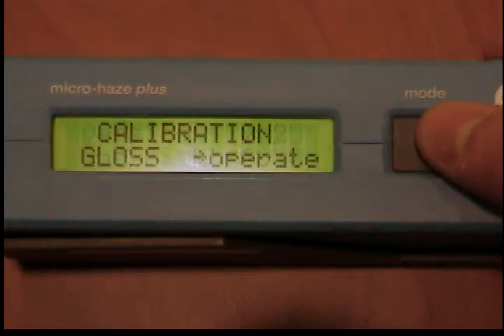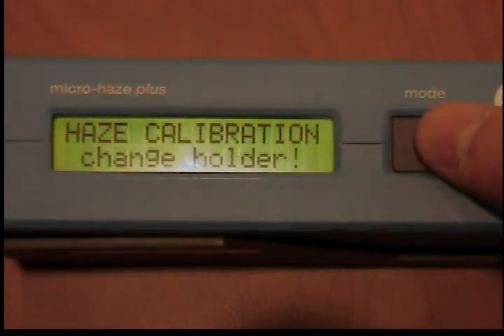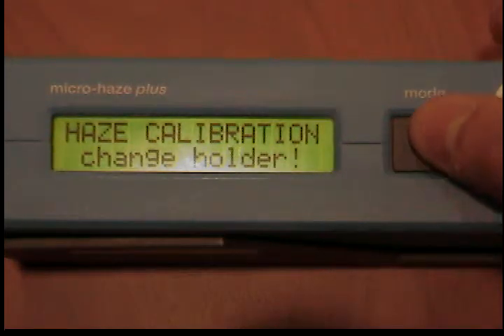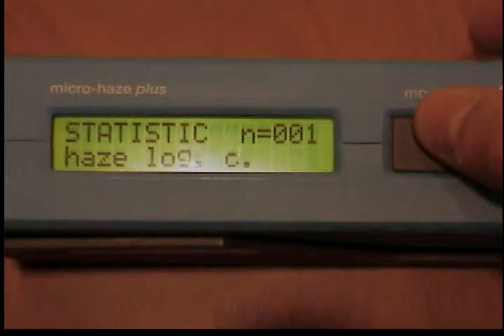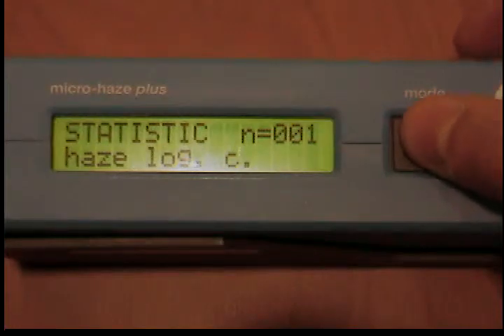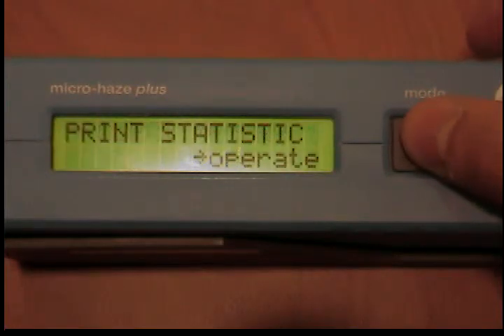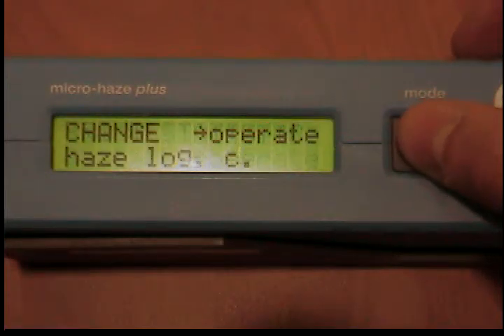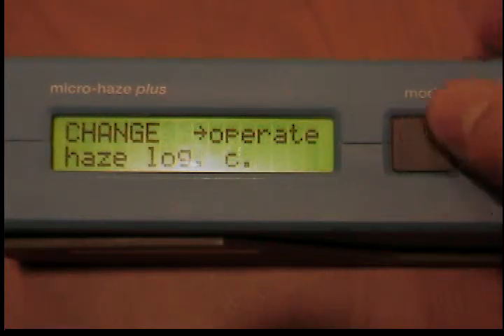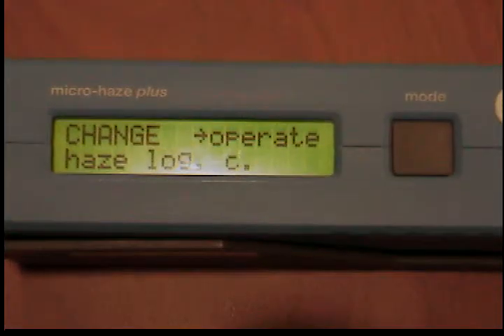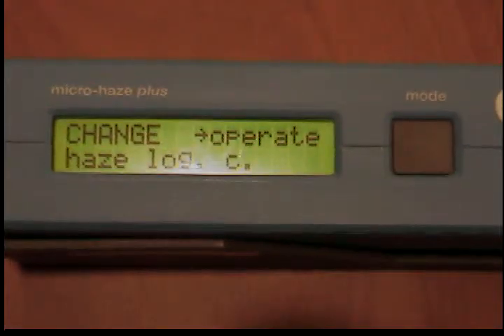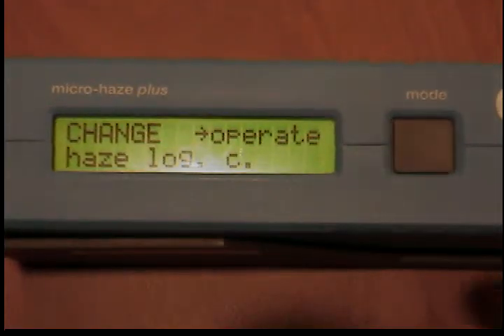Changing the haze scale. Two different display modes can be selected to display the measured haze values: Hlog, logarithmic scaling with brightness compensation, and Hlin, linear scaling without brightness compensation. Normally, the setting Hlog is used. Hlin is only used for special applications.